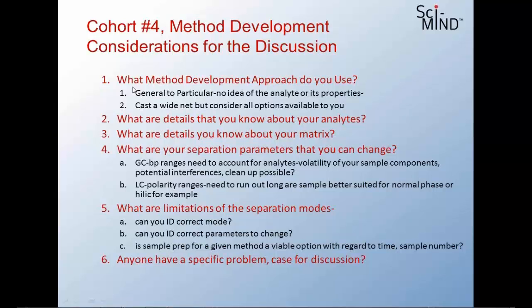I mean, historically, you'd go to a normal phase separation where you could use like a hexane or an IPA, but I think what's becoming increasingly popular now that it just hasn't caught on yet is SFC. So with SFC, it allows you to have liquid-like permeability, gas-like diffusivity properties. You can essentially really gain a lot of efficiencies and run these at really high flow rates to get high efficiency at the same time.